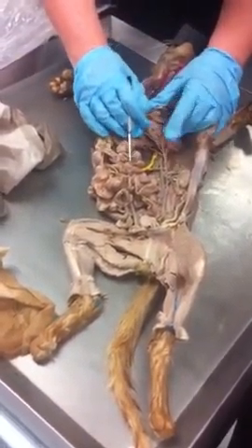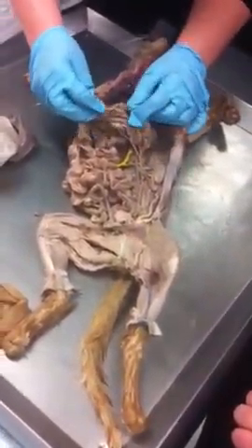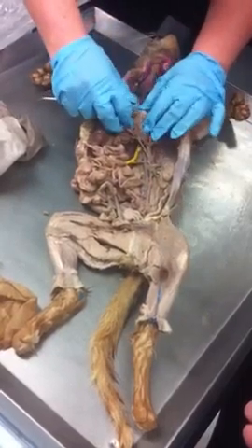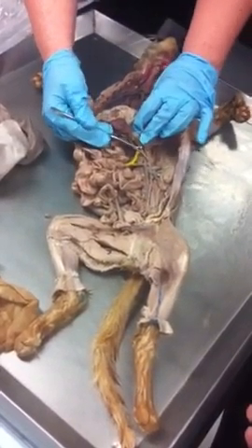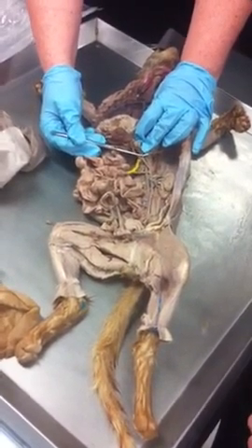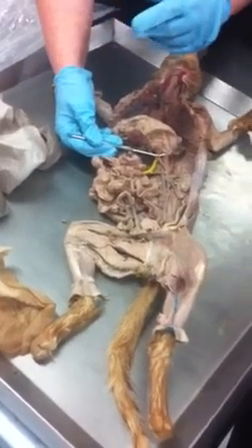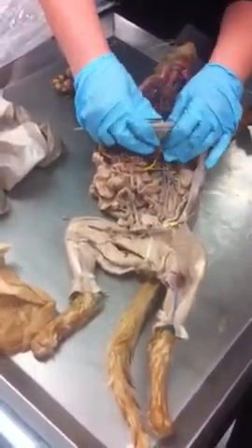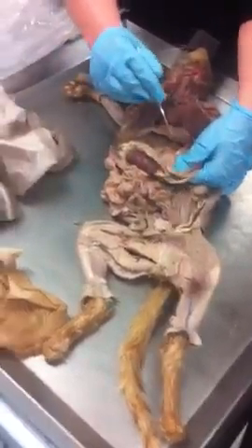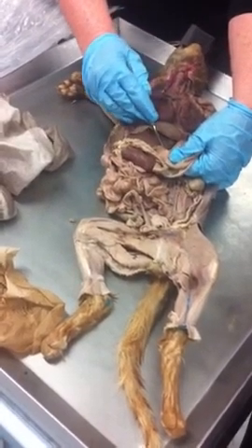And then we've got our three main branches. Let's see if I can even see them. The easy one is this one. Yeah. And then we have the other two. The left gastric. Make sure, some people put left and right gastric. Make sure you just put left gastric. Yeah, there's a right gastric around the loop, but this right here is just the left gastric. And that's the one that's going to go to what part of the stomach? Oh, the lesser curvature. Yeah, so look for it traveling along the lesser curvature.